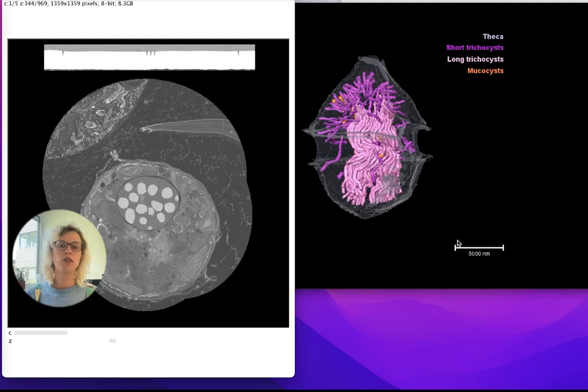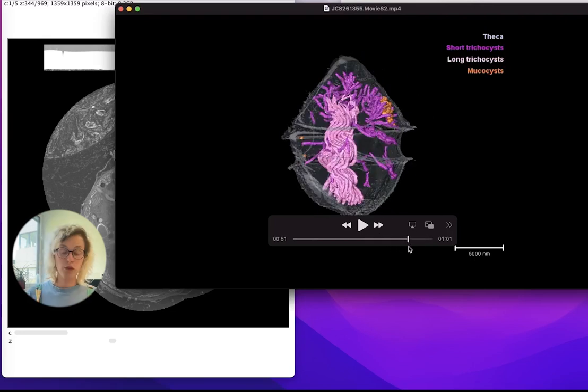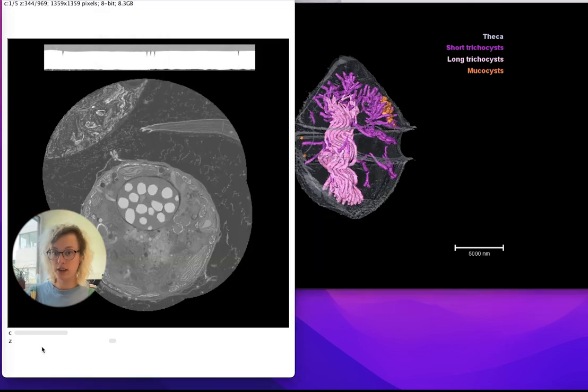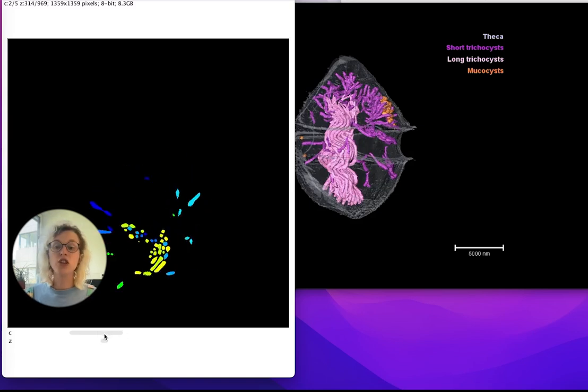This dataset in the original data has 14 different segmentation channels, and these all do load together in Blender, but it was hard to manage, so I only have a few of them included. So we have a TIFF stack with 5 channels: first our data, then we have our trichocysts. So these we can see like this. These are integer label masks with the same pixel density as the data, each with a separate value.